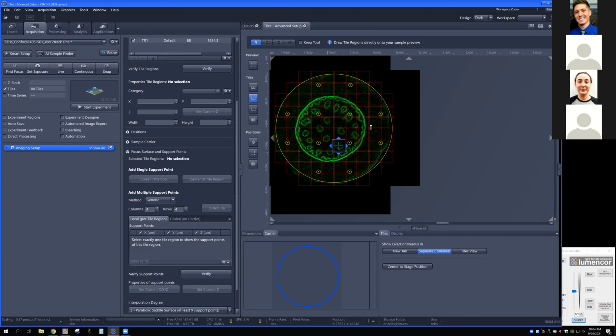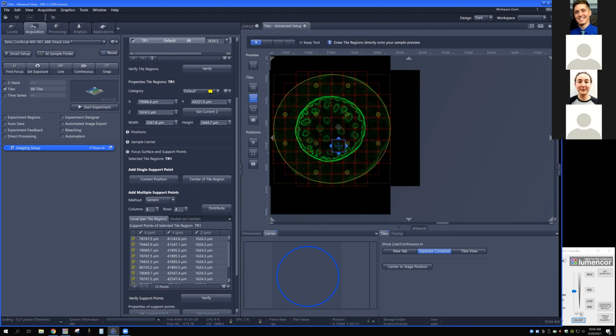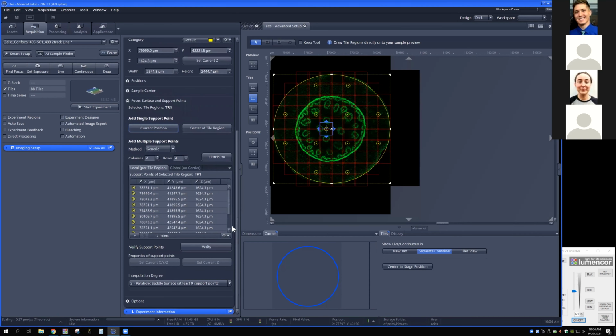I'm going to have to work on that. I used to be really good. So I'll make sure that I can show you how easy that is when we actually get there. But the other thing that we can do is we can add them where we are. So if you know that there's a certain spot that's a high or a low, you can add these at those points on the tissue.